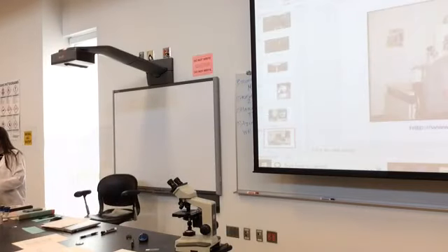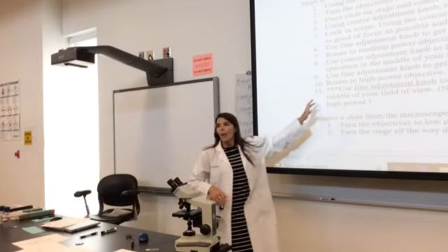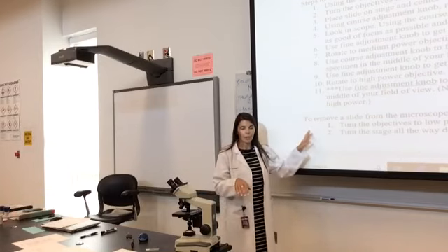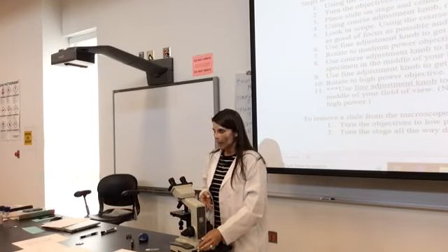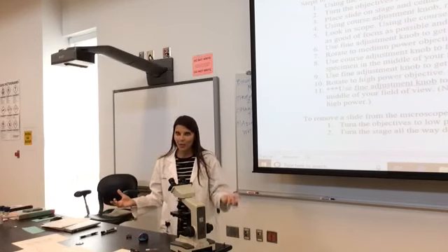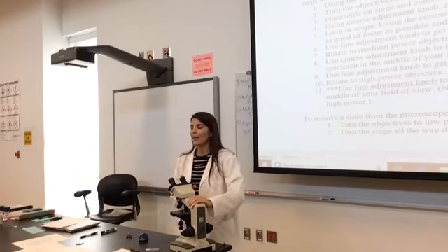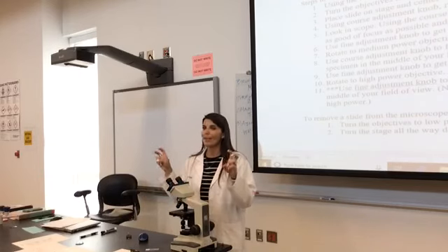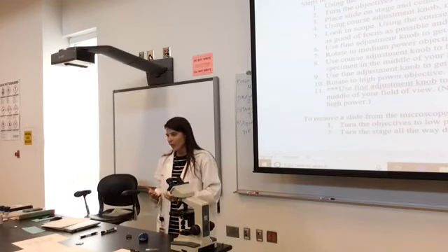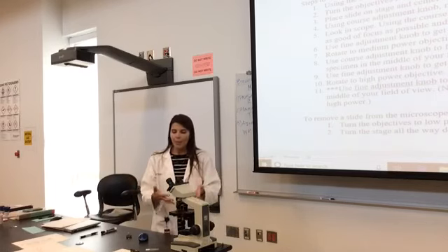In eCampus, there is a list of instructions for the proper use of a microscope. What I'm about to do is explained word for word right there. I'm just demonstrating it, so you can see it here in writing. When you walk up to me, we'll do volunteers first, but then you might just be selected if nobody volunteers. Your microscope is going to be in disarray. I am supposed to mess it up so that you're forced to follow the steps. You have 3 minutes. It's plenty of time if you practice a few times. It's plenty of time, I promise. It's messed up right now.